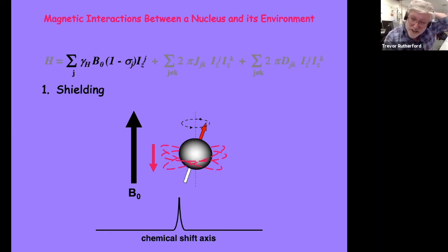And we use chemical shift rather than the absolute frequency, because the chemical shift is the frequency expressed as a ratio of the applied magnetic field. In other words, it is normalized against the applied magnetic field strength. So if we express our frequencies as a chemical shift, every single spectrometer in the world will produce a signal at that same chemical shift value, okay? Because it's normalized against the strength of the magnetic field that's applied.